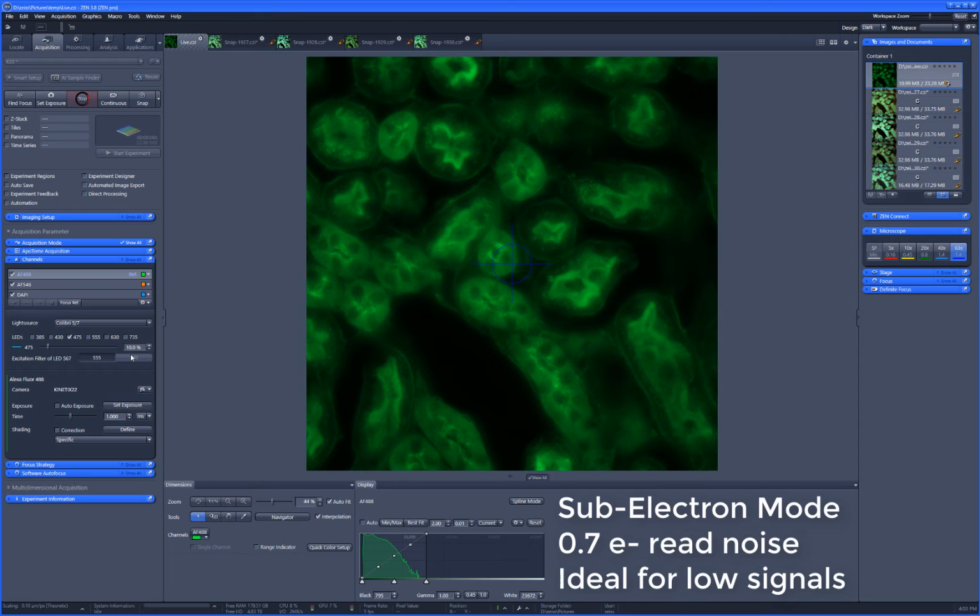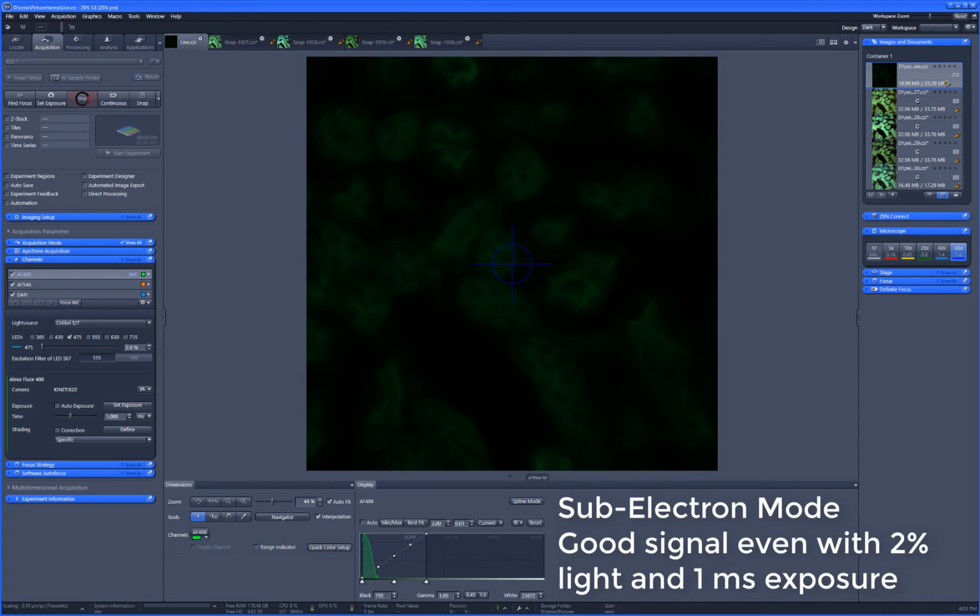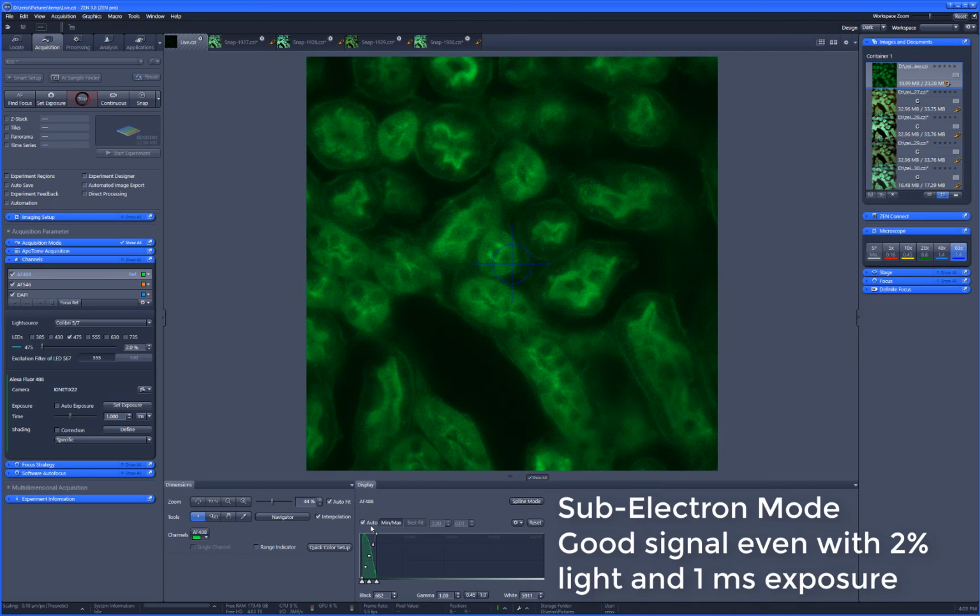Sub-electron mode. This is 0.7 electron read noise. Now we can drive the signal down even further and still get a great picture. Here we're at around 2% light and 1 millisecond exposure. Really low signal, but still, it can easily capture it because you're not read noise limited as much anymore.